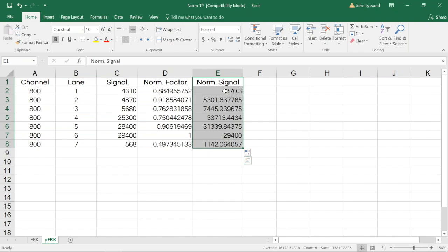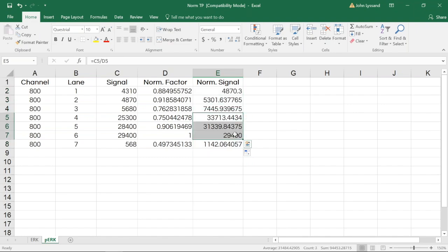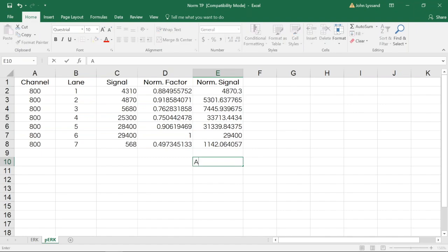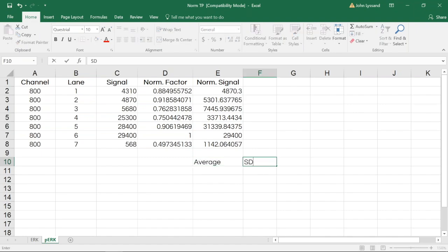In this example, lanes 1 through 3 are replicates, and lanes 4 through 6 are replicates of one another. From here, we can use Excel functions to calculate what the average of these three replicates and standard deviations are.